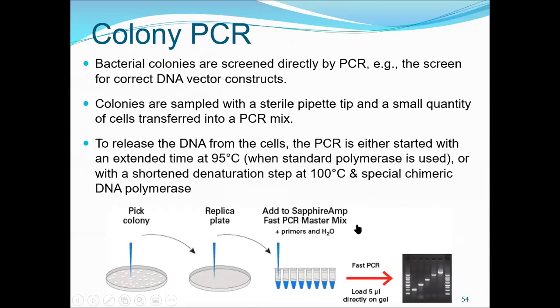The only thing is it is PCR, but with a little higher denaturation step, so that from the bacterial colony, the DNA is extracted out during the PCR itself.